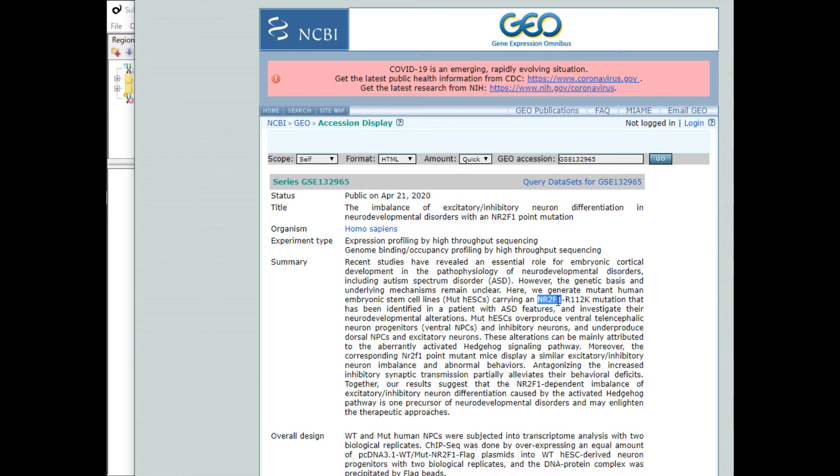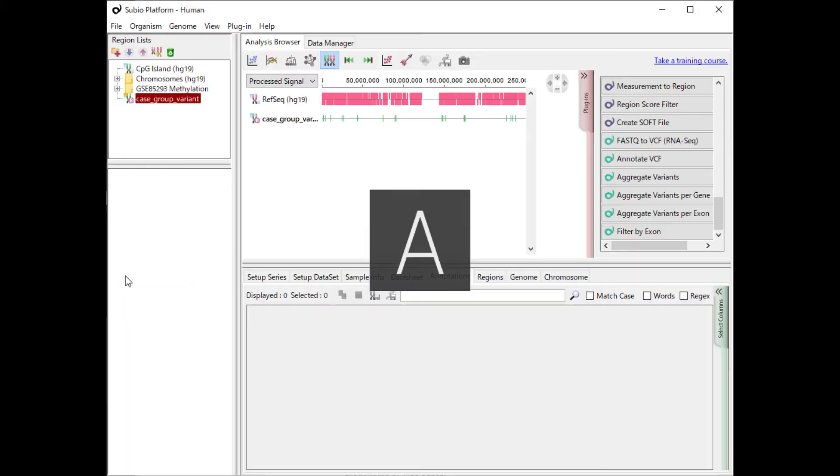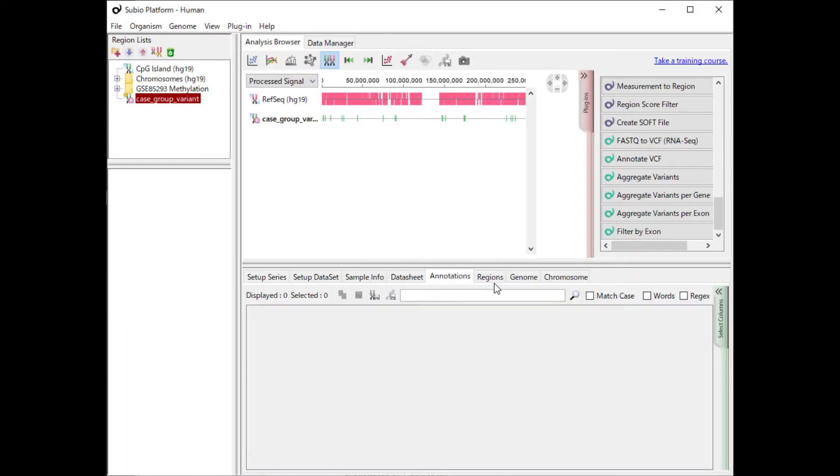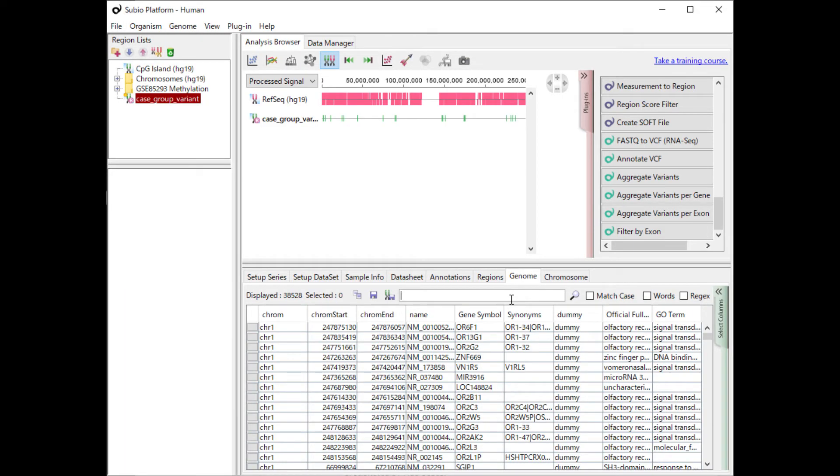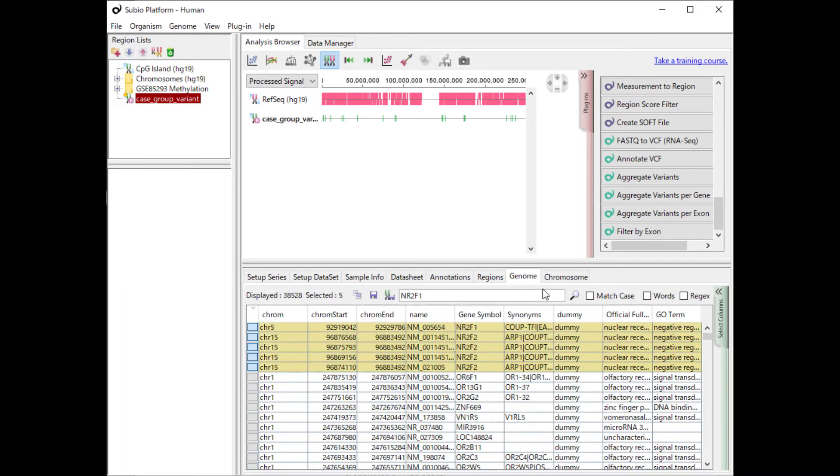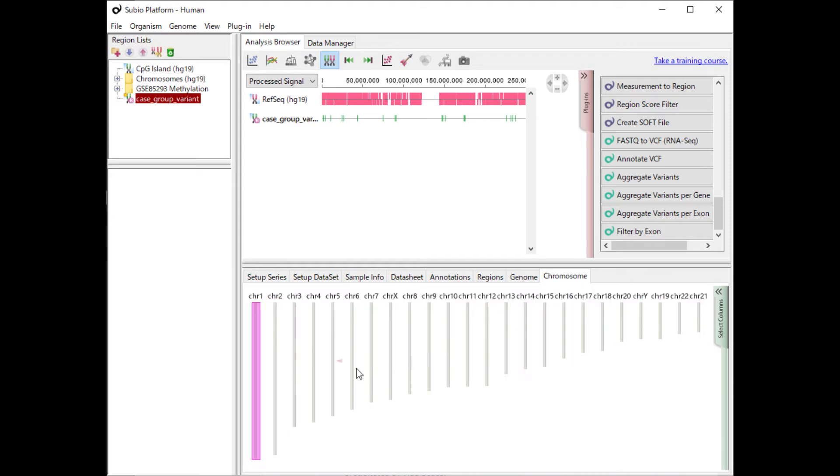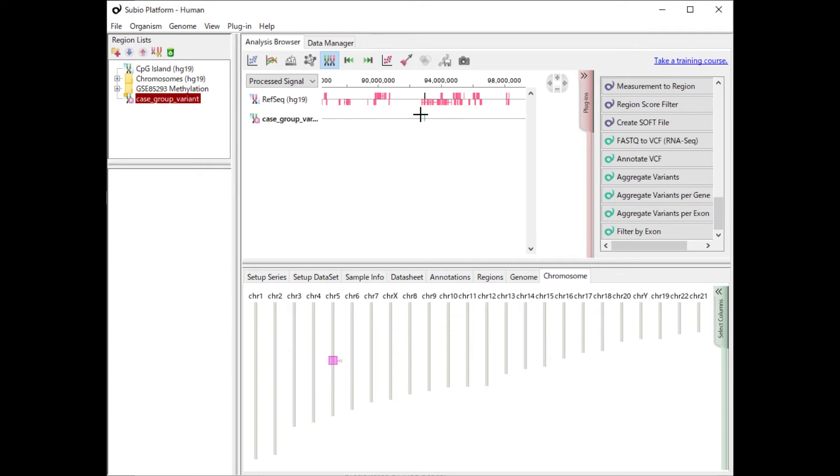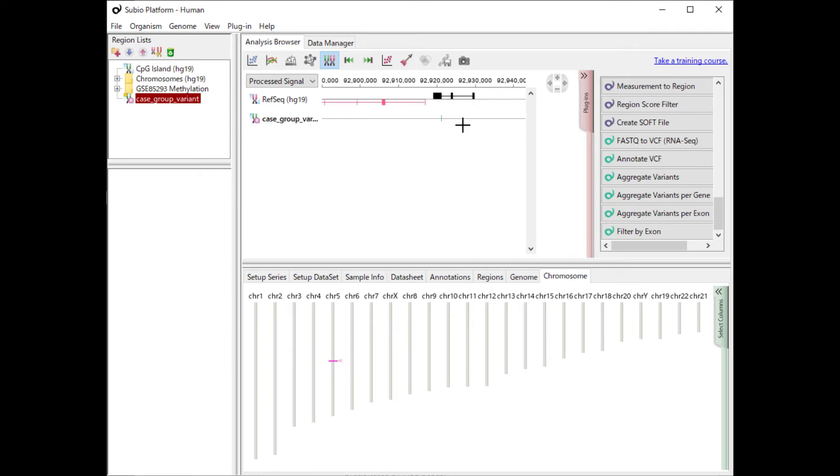Search for the gene name in the genome tab. Check the location of the gene in the chromosome tab at the bottom of the page. You can zoom in on the surrounding area with genome view.